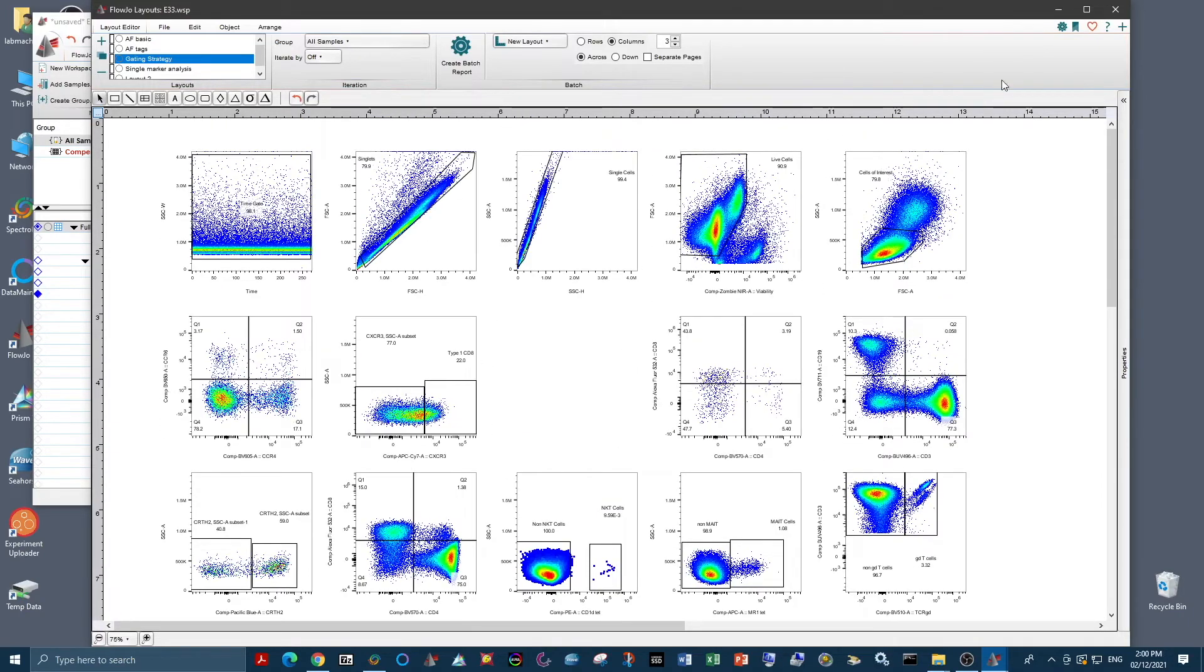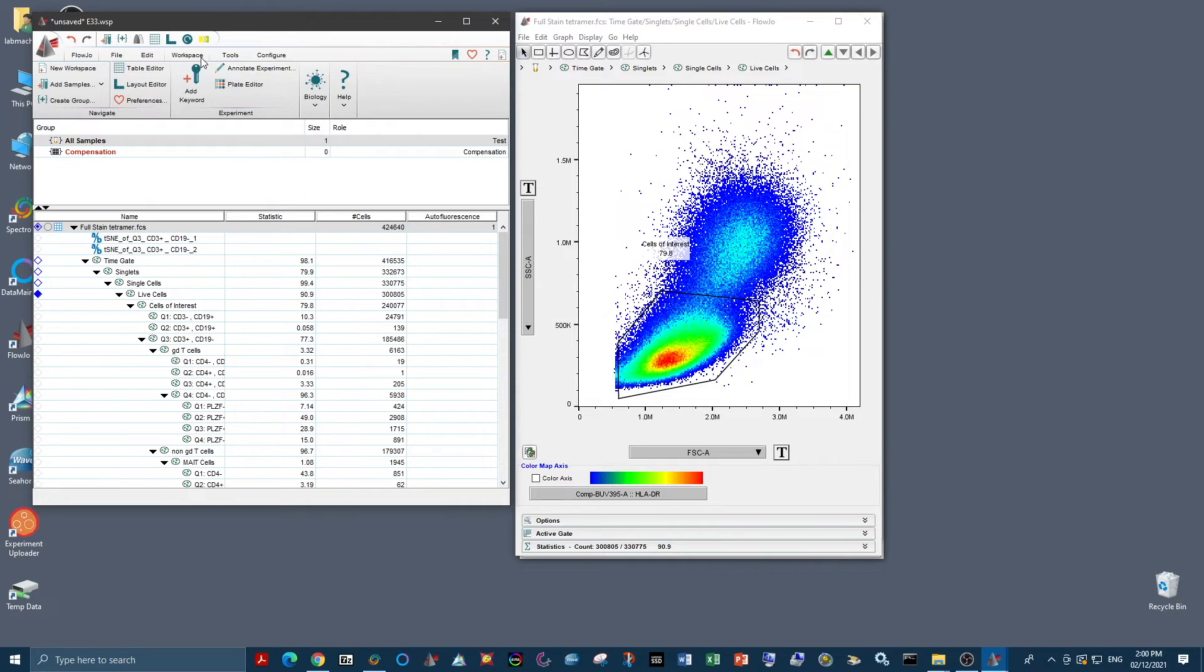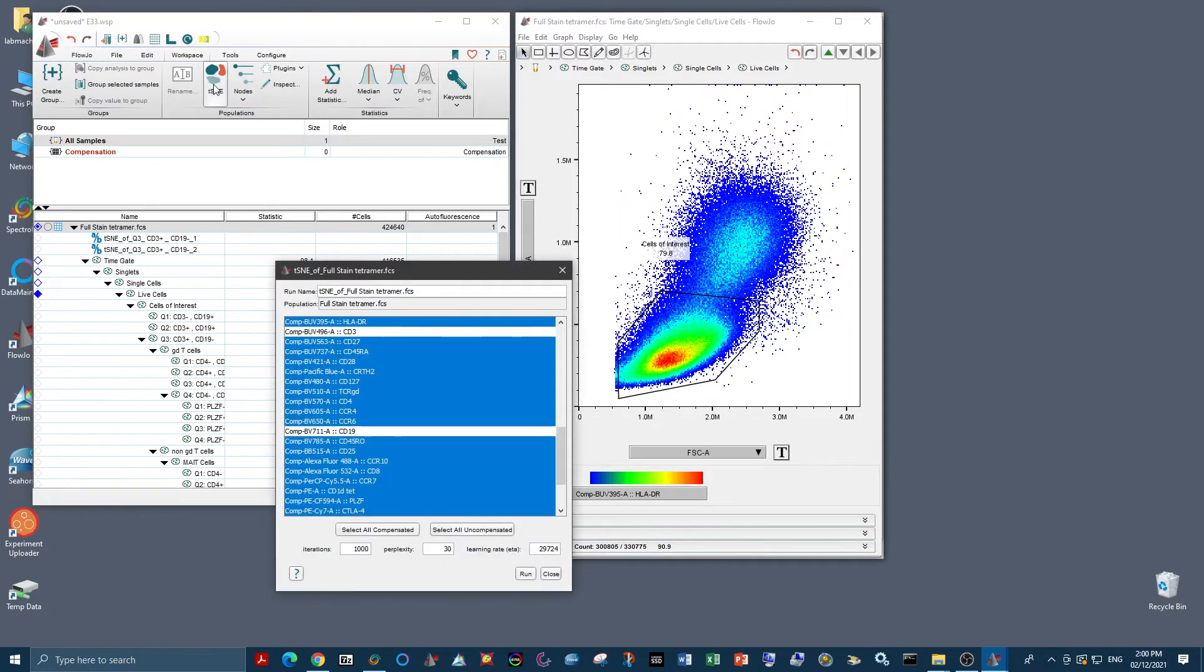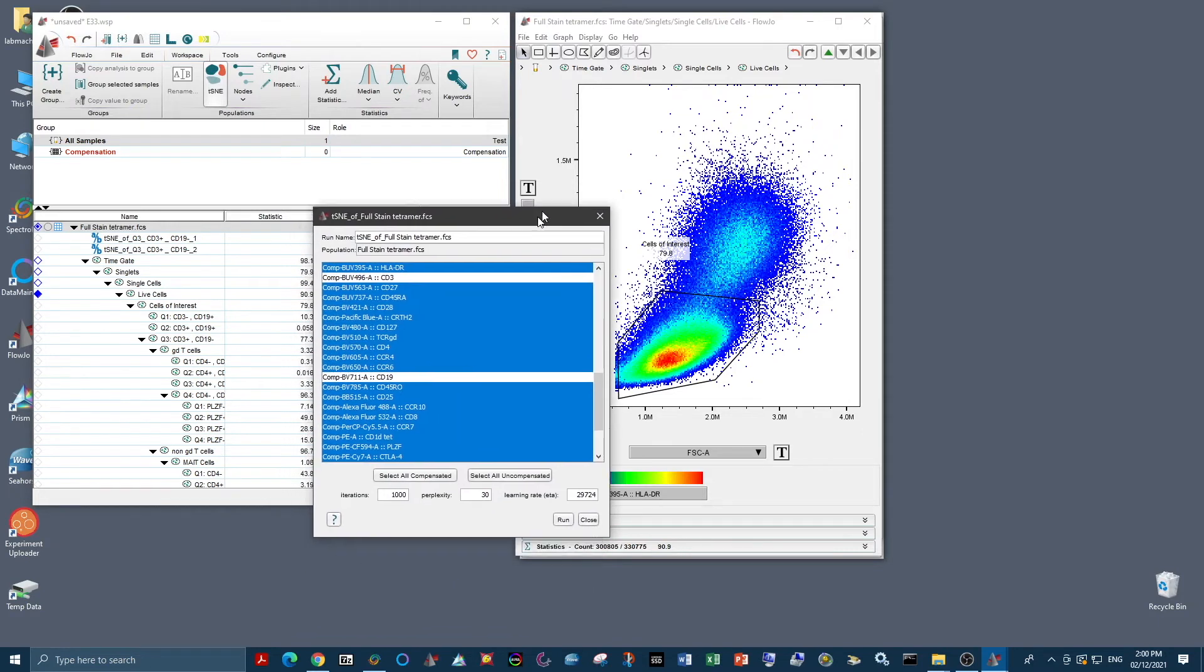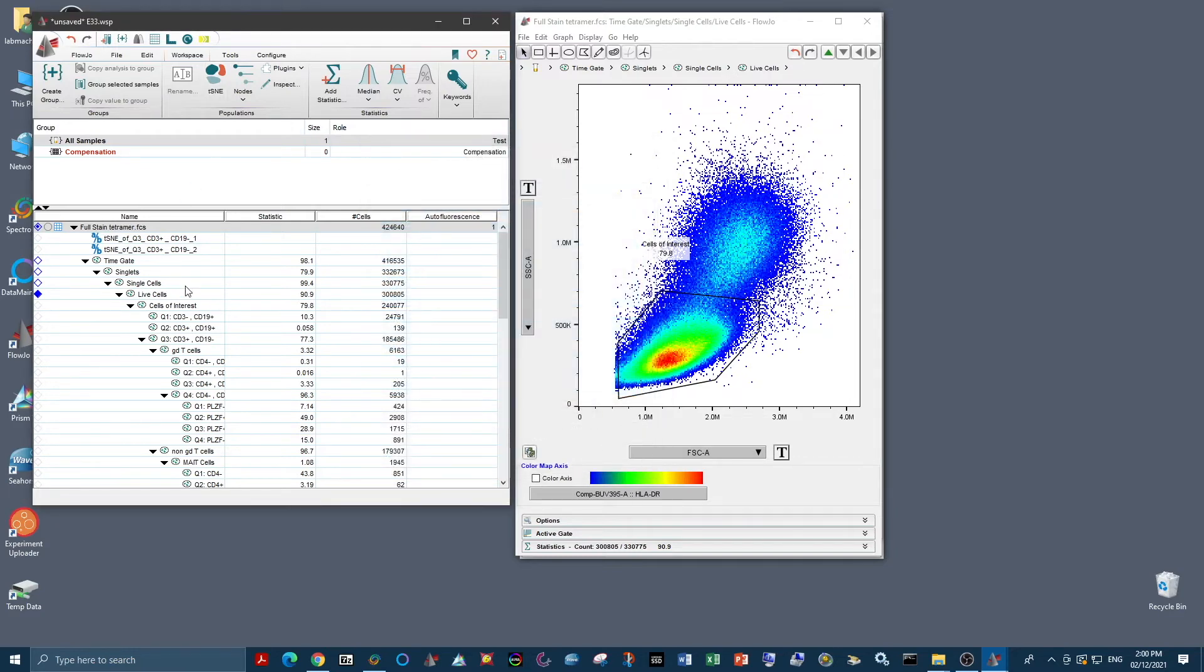Once we're happy with our gating strategy, the next thing we need to do is a dimensionality reduction algorithm. So the easiest one to do here in FlowJo is tSNE. So we just go up to workspace and we find the tSNE here. We then select the parameters that we want to run. And we want to make sure that we're only selecting the population that we're interested in. So, of course, we did all of that cleaning earlier, which means we want to actually take a nice, clean population.